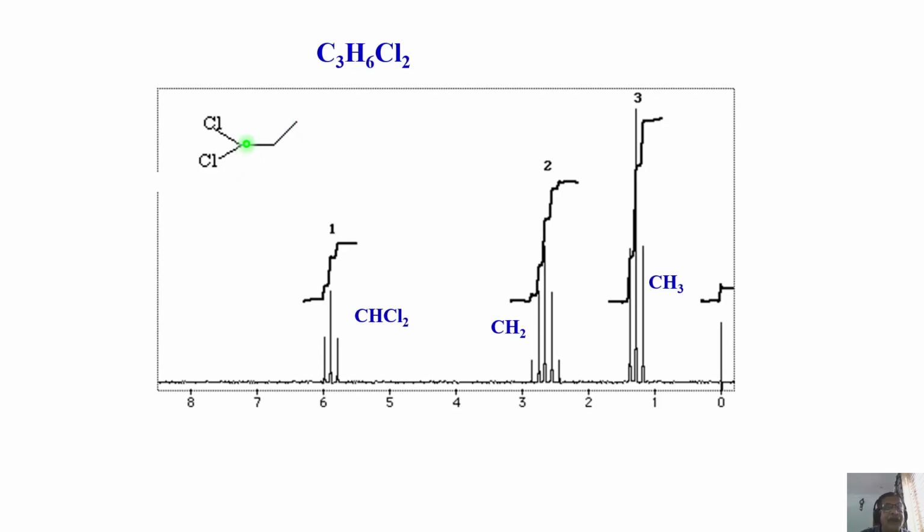So you are not going to get only 4 lines, a quartet of intensity 1331. You are going to get 8 lines, in such a way that the 1331 ratio is still maintained: a doublet, doublet, doublet, and doublet of intensity 1:1, 3:3, 3:3, and again 1:1.